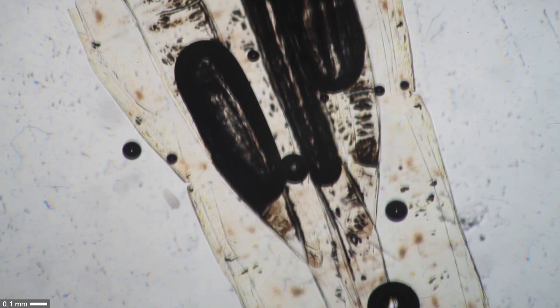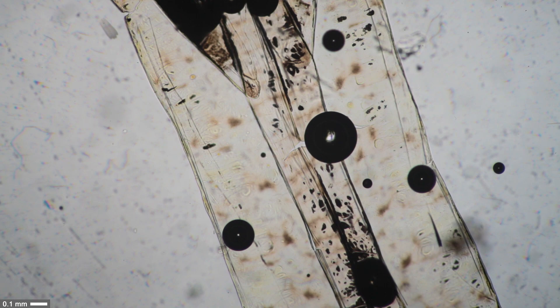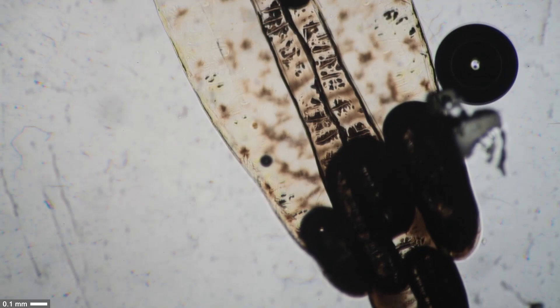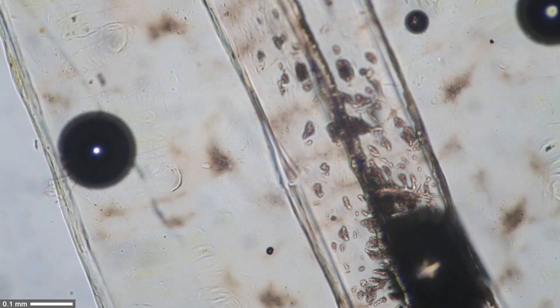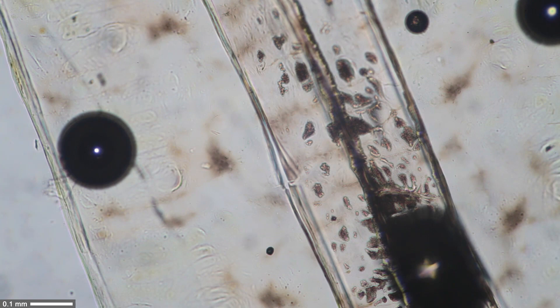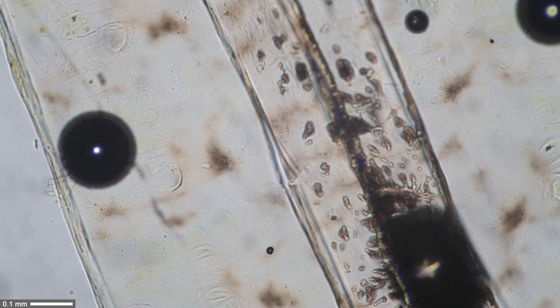That is now basically at a slightly higher magnification. I'm focusing right now. As you can see, very transparent. There are no cellular structures visible, which does not surprise me, because the shell is probably most likely, just like the exoskeleton of the insect, made out of chitin. I'm playing around now with the condenser aperture diaphragm.